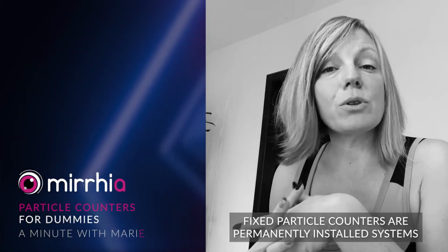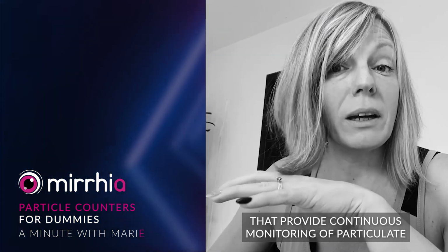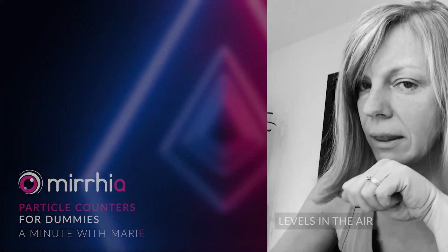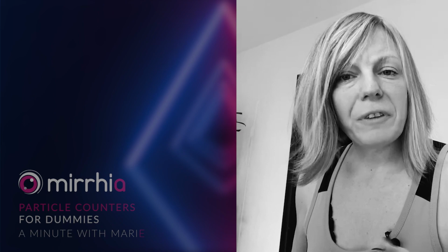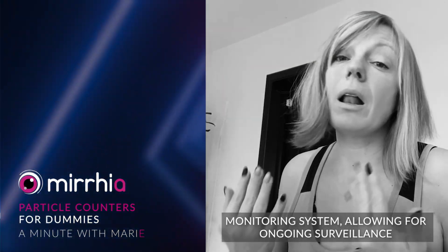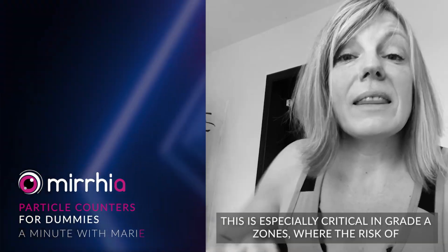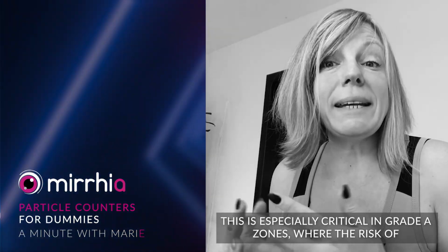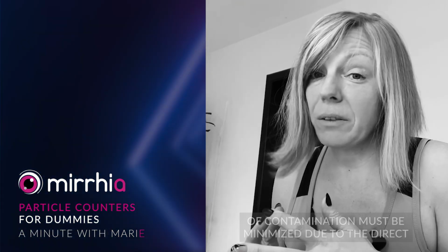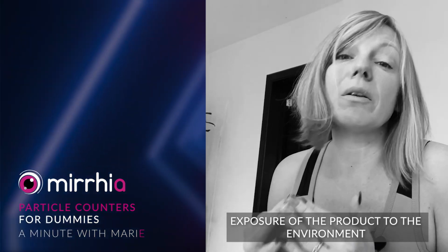Fixed particle counters are permanently installed systems that provide continuous monitoring of particulate levels in the air. A fixed particle counter might be connected to a central monitoring system, allowing for ongoing surveillance of the cleanroom's condition. This is especially critical in Grade A zones, where the risk of contamination must be minimized due to the direct exposure of the product to the environment.